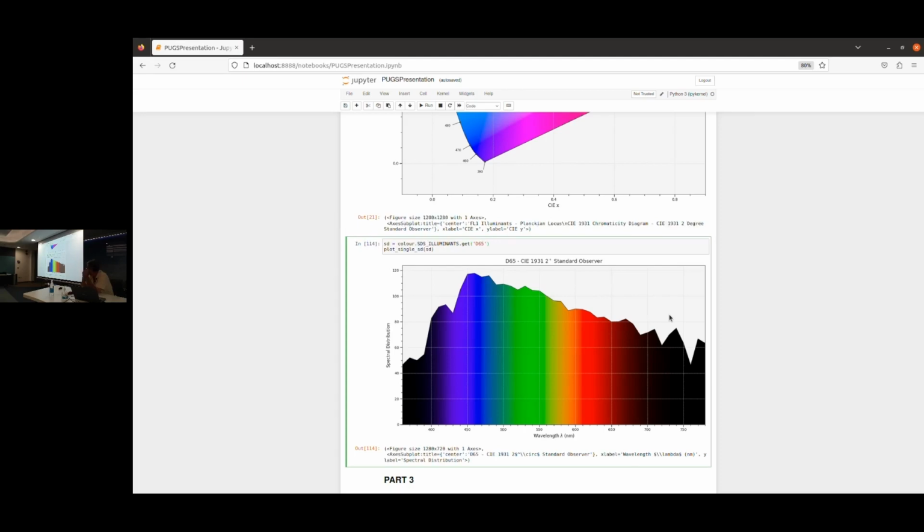So there are ways of finding the difference, and of seeing how much we adjust X and Y to achieve a target X and Y. Colorimetry is just one part of this package. There are other things available in it depending on your interest, biochemistries, and so on and so forth. I have not touched upon those, just scratched the surface of color measurement today. So this is all on the color science package, colorimetry methods that I want to mention today.